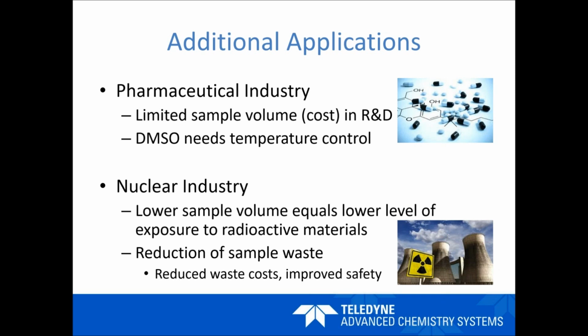So we're exploring all the time new ideas, new approaches to looking at low volume, low introduction flow rate, and how beneficial this is to ICP-MS analysis across the board.